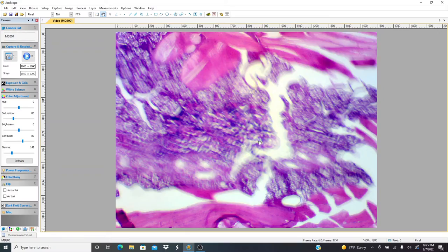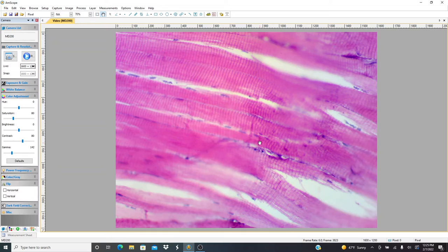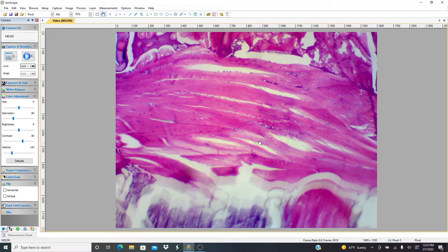This is interesting. The most surprising thing for me is just this ton of skeletal muscle. You can see the cross bands here up close. Pretty cool. It's very prominent, more prominent than in humans. I'm not sure what that means. But I don't see any smooth muscle. I just see skeletal muscle.